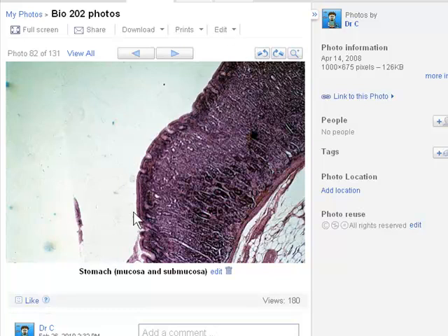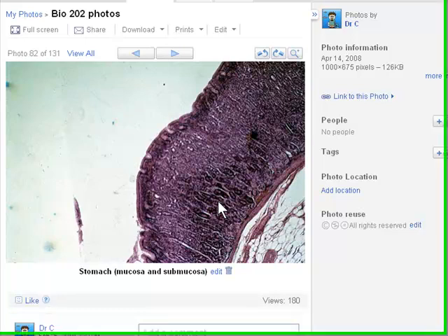Okay? All right, so all this is tunica mucosa that you see here, with the broad waves of the rugae there. These little indentations that you see along here are the gastric pits. Okay? Now, within the stomach slide and within the tunica mucosa, there are two types of cells that they have to find, the parietal cells and the chief cells. Now, on the stomach slide, there are three sections of the stomach. One of those is actually stained well enough that you can find the chief cells and the parietal cells. Okay, so you've got to look through. I think it's the middle of the three sections. So you're going to be zooming down in this area and looking for the pink parietal cells or the darker purple chief cells. And you need to know what each of those secrete as well.